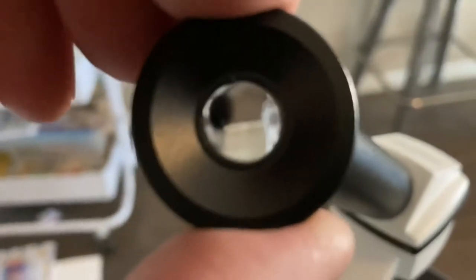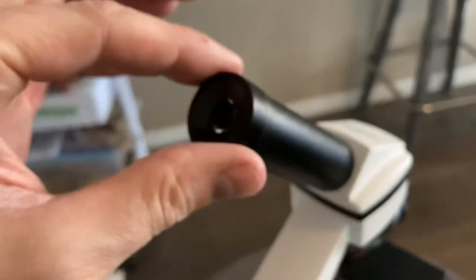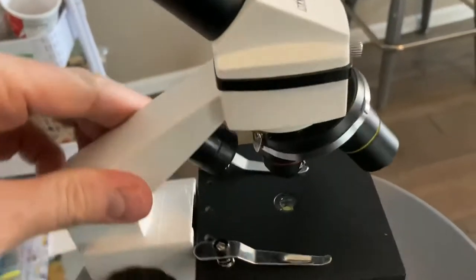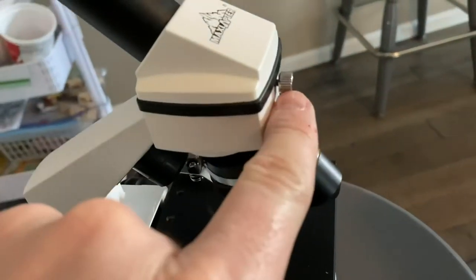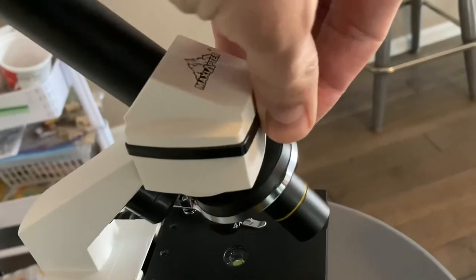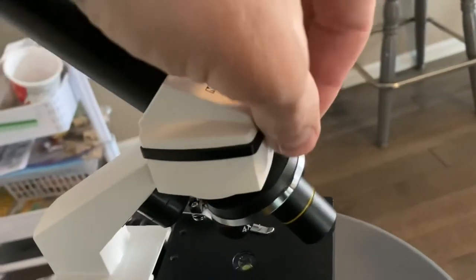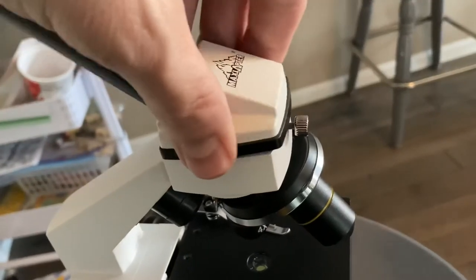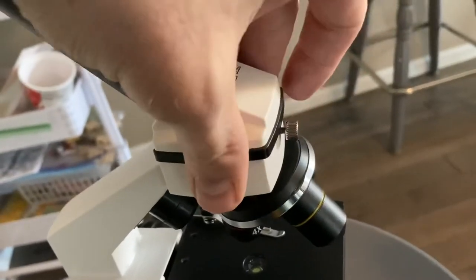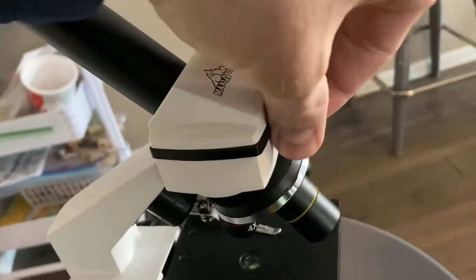Here's the eyepiece — it does fall out a little easily, so don't tip it upside down. You might want to wrap a piece of tape around it to make it a bit thicker so it doesn't fall out. That's a potential drawback. On the plus side, there's a little metal knob that lets you remove and rotate the eyepiece tube in whichever direction you want — that's a nice added feature.